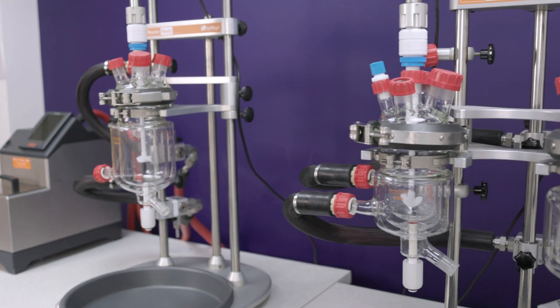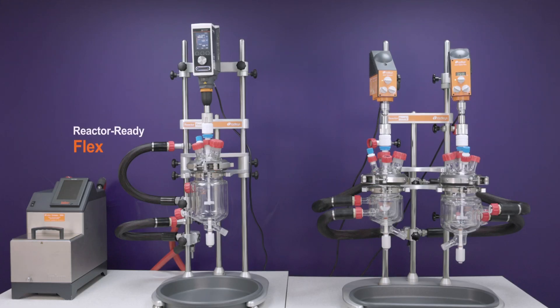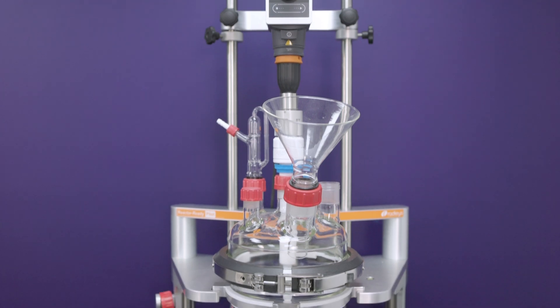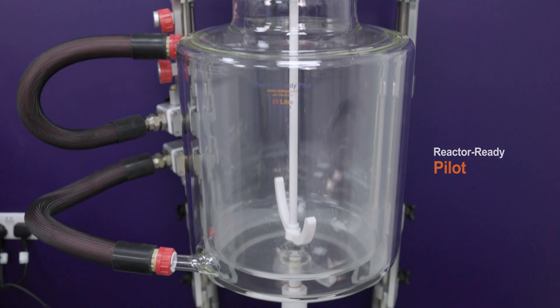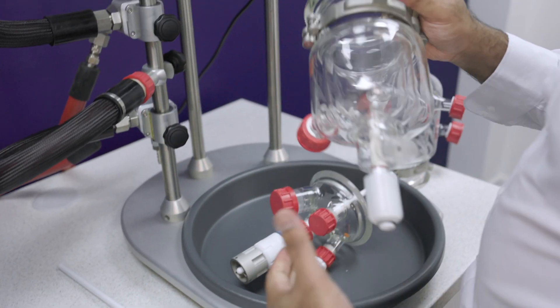Our reactors are designed to be flexible so that they can scale up or down with your project. Reactor Ready Flex and Reactor Ready Duo can accept vessels from 100 ml up to 5 litres without any changes to the framework. The Reactor Ready Pilot framework accepts vessels from 5 litres all the way up to 35 litres, and for all of these reaction setups, vessels can be changed by hand with no tools required.